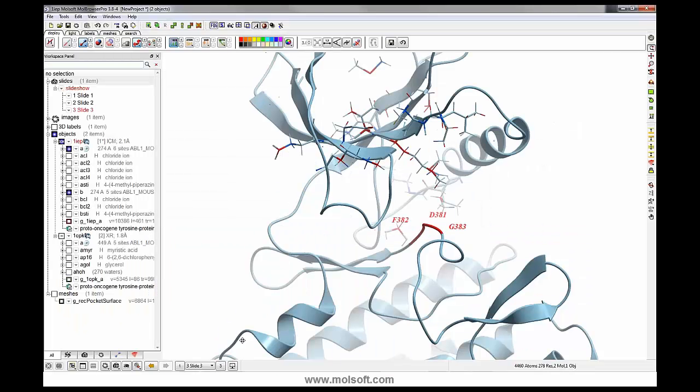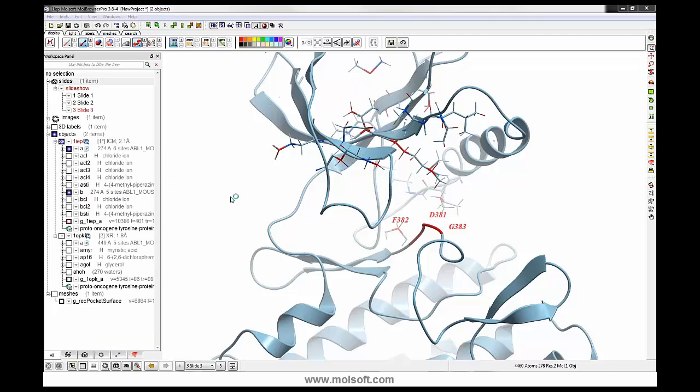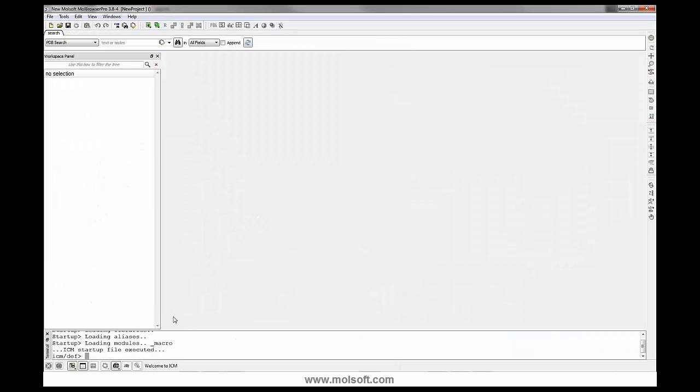The movie is written out, but let's quickly view that. It's a standard MPEG-4 movie. Maybe I'll show it later on. But so we go to, I'm just going to read a new session just for this graphical effects part.